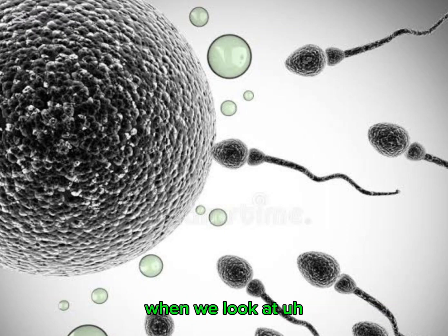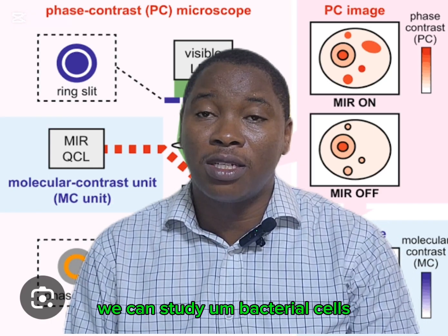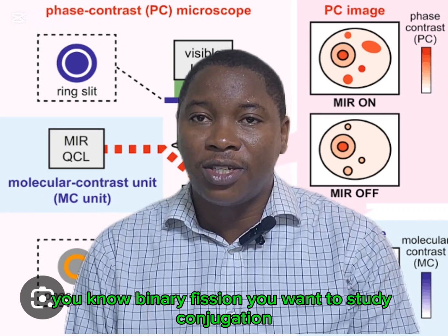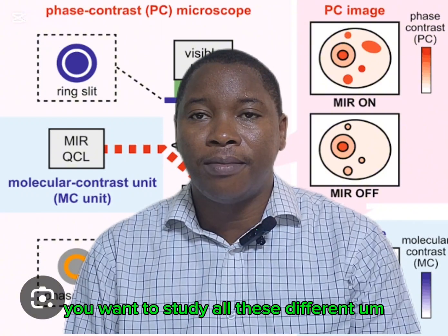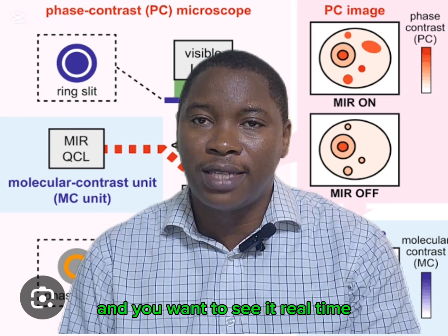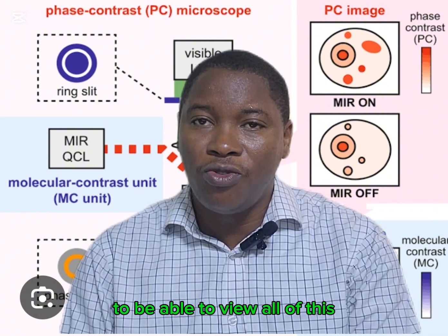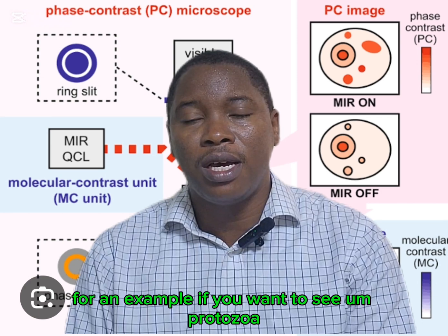When we look at some of the things that we can study in phase contrast microscopy, we can study bacterial cells. So if you want to study the way bacterial cells divide, binary fission, you want to study conjugation, you want to study all these different life processes that bacterial cells are involved in, and you want to see it real time. You want to see how it is occurring. You can use the phase contrast microscopy to be able to view all of this, and you can see it real time.